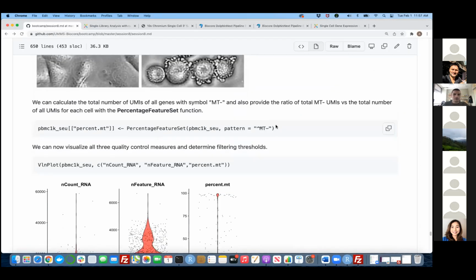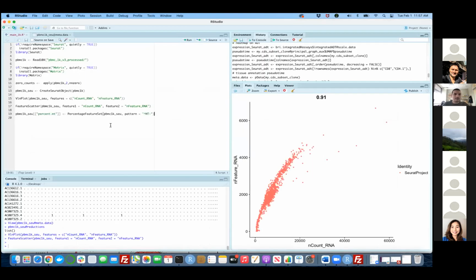The way to do that is really simple. By the way, guys, now you should be able to understand that all single cell related operations are super duper easy to use in R because it is well packaged in Seurat and you can use them right away. So basically what this function is doing is grabbing all the genes that start with MT- to indicate that these are the UMIs captured associated to the mitochondrial DNA.